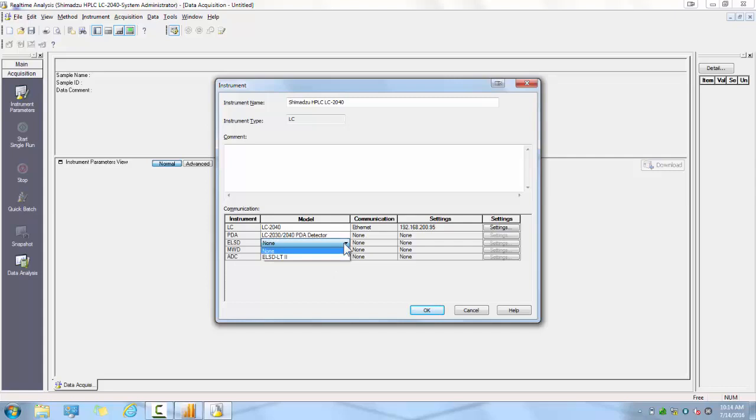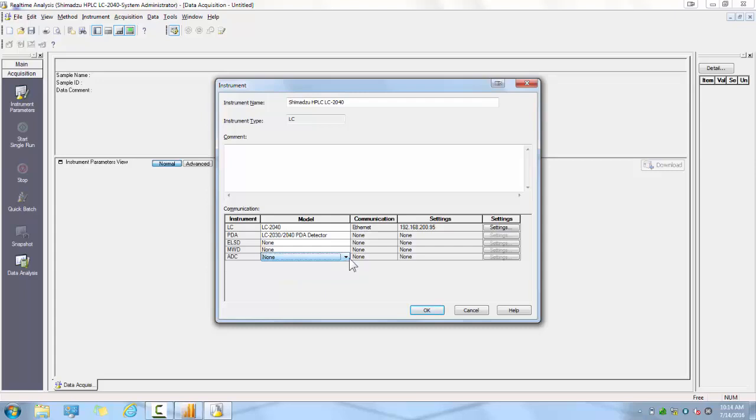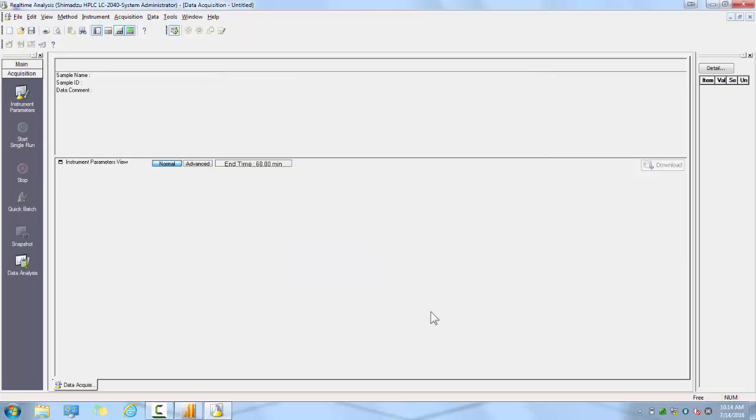If you have an ELSD, you will be able to select the model from the drop-down menu to include in your hardware configuration. If you have our multi-wavelength detector, you can select it here from the drop-down menu. If you have an analog-to-digital converter box, such as our CPM-201M, you select it here from the drop-down menu. Once you have finalized all of your hardware communication settings, click OK. This will bring you to the system configuration menu.